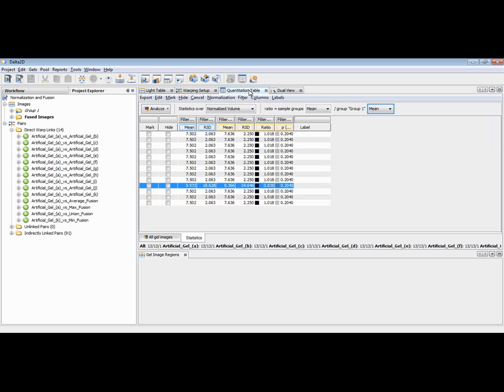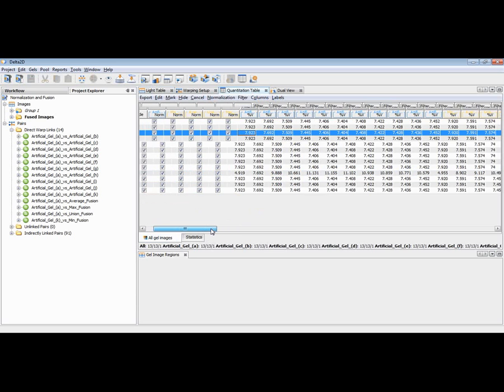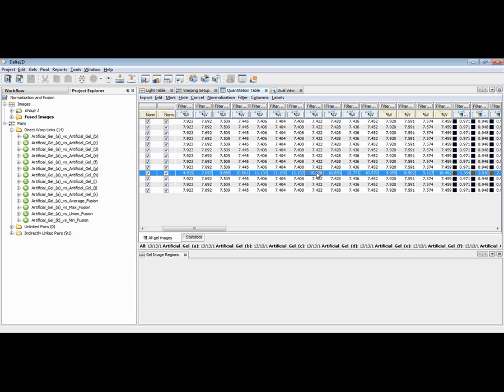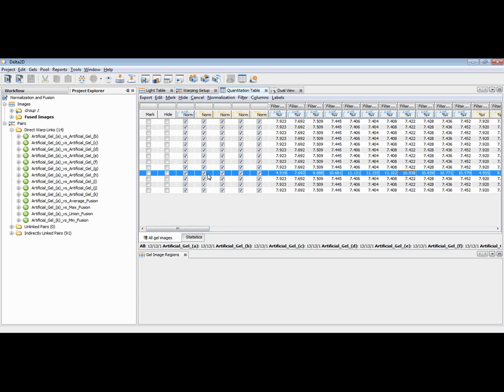Now let's have a look at the quantitation table for all the gel images. As you can see here, all these spots that visually do not change their intensity change the intensity after normalization because of this strong spot, which is part of the normalization basis. The strong spot is this one, and if we exclude this spot from the normalization basis, here we have the normalization columns, and we can exclude all these strong spots from all the images by just pressing exclude selected spots from normalization set.